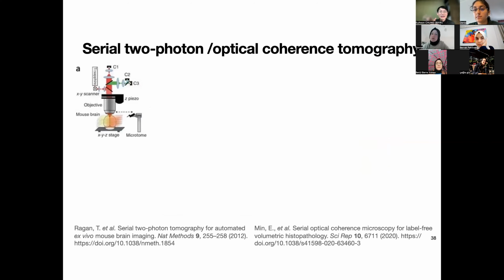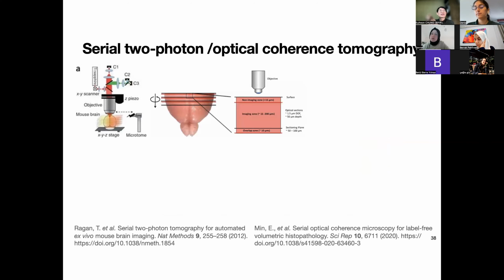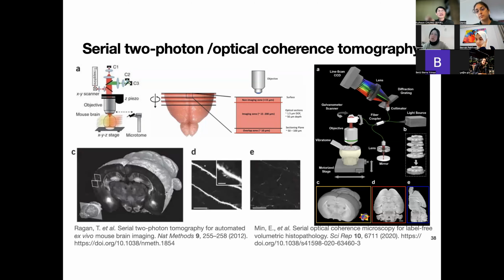but I have to say, with a microscope you cannot get microscopic resolution very deep, let's say several hundred microns. So a trick to image the whole brain is you take an image at some depth and cut it out, and you take another, cut, take a picture, cut, and you reconstruct the whole 3D at cellular resolution.